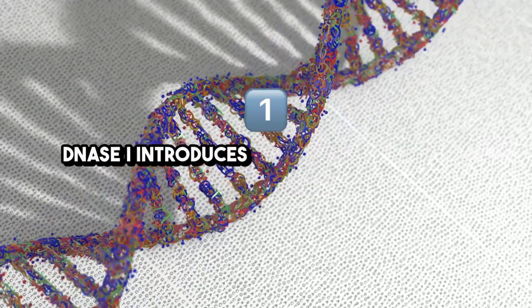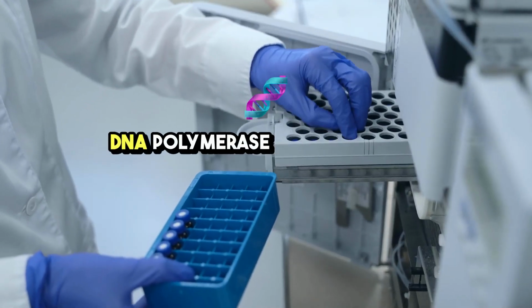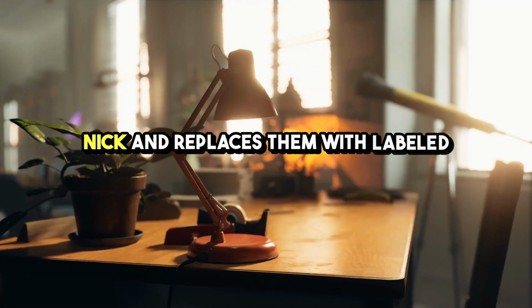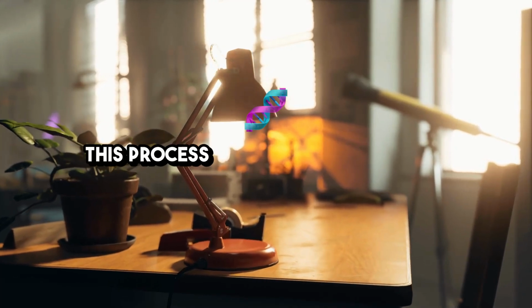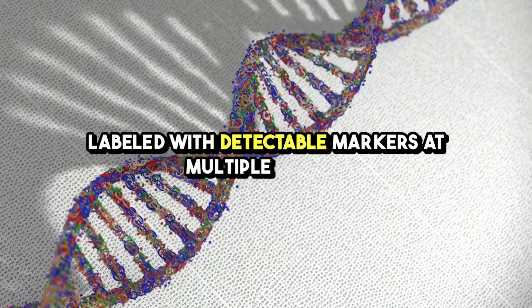DNase I introduces single-strand breaks, or nicks, in the DNA. DNA polymerase I then removes nucleotides around the nick and replaces them with labeled nucleotides. This process results in a DNA strand labeled with detectable markers at multiple points.